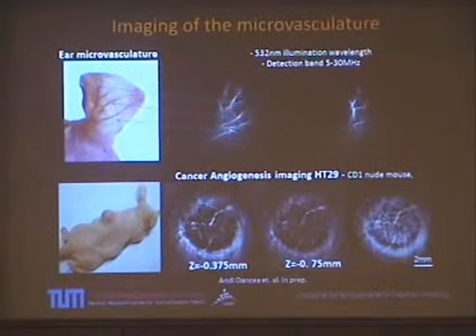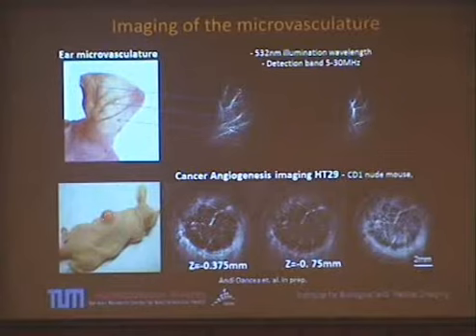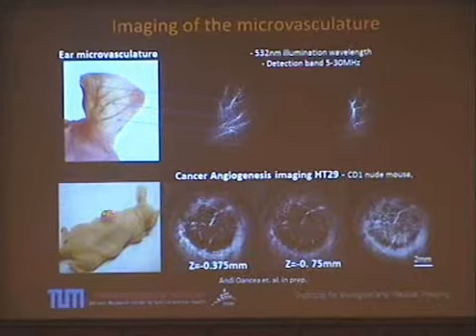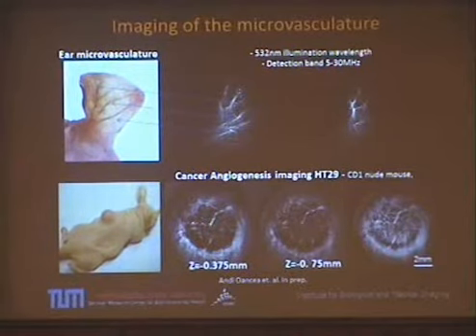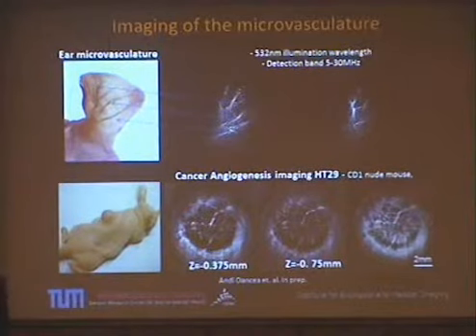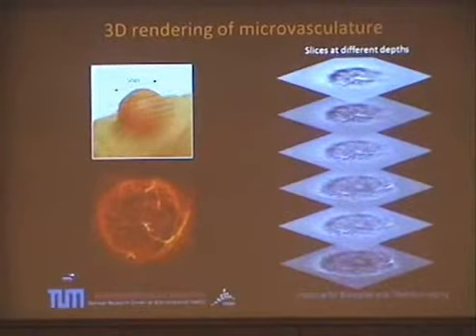The first thing that we can see when we can see absorbers with high resolution in tissue is blood vessels, because hemoglobin is the major absorber. So we can go through an entire tumor here, 7 millimeters, and see, maybe with 30 microns, blood vessels in the tumor. Of course, in the mouse here, but also through 7 millimeters, we can start having high-resolution optical imaging. This performance has never been present before because microscopy will only penetrate down to this depth. So we can do three-dimensional slices and we can see the vascular system of the entire tumor.